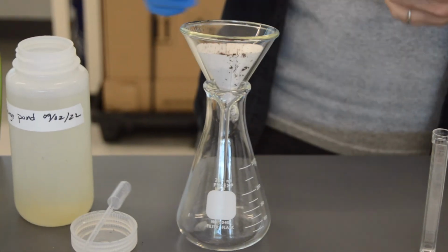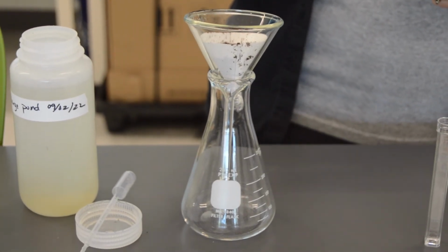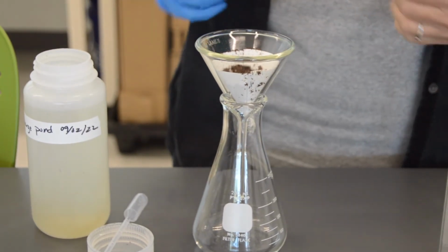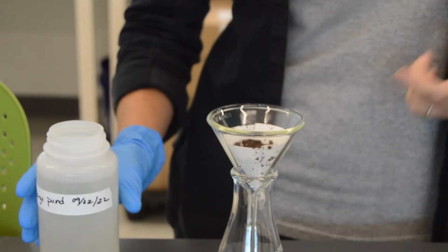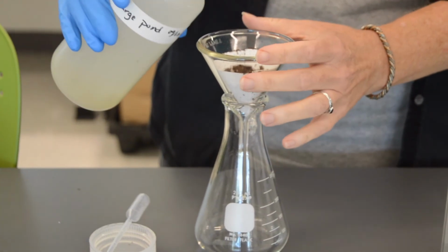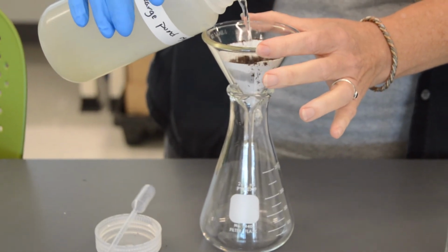Pond water for the most part, so we're going to try running some of the pond water through potting soil that has fertilizer in it, and so then we can retest our samples and see if we've increased the levels of nitrate and phosphate to simulate runoff potentially from gardens.